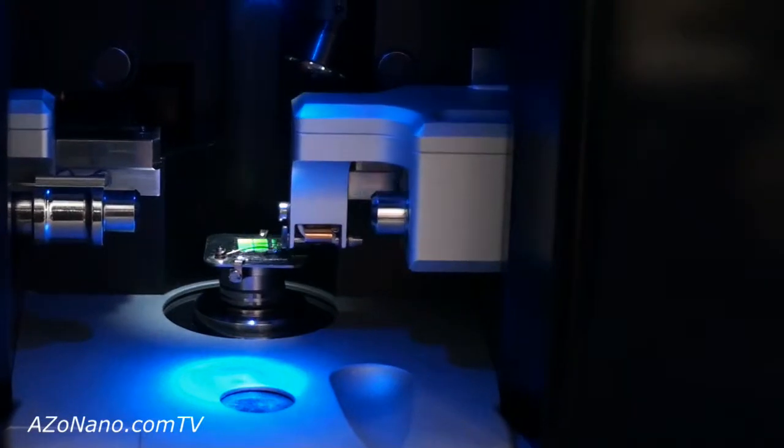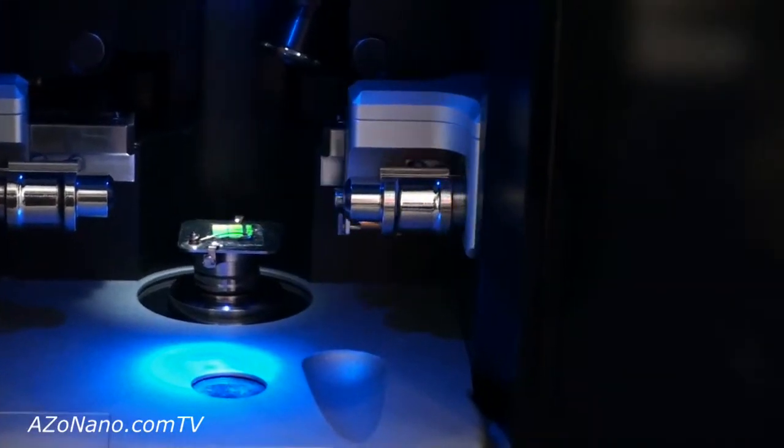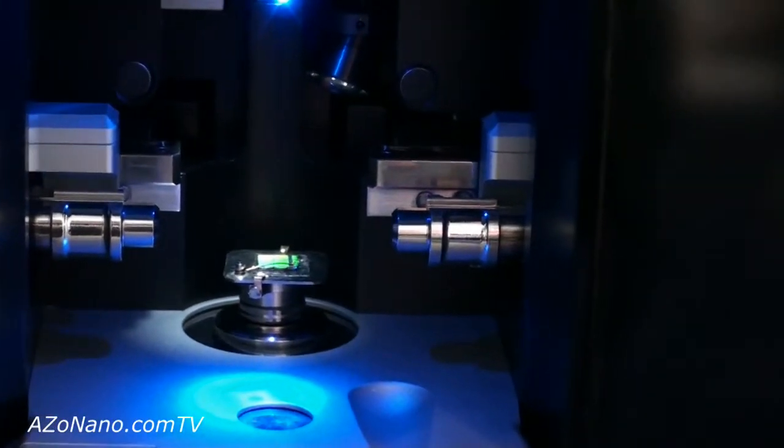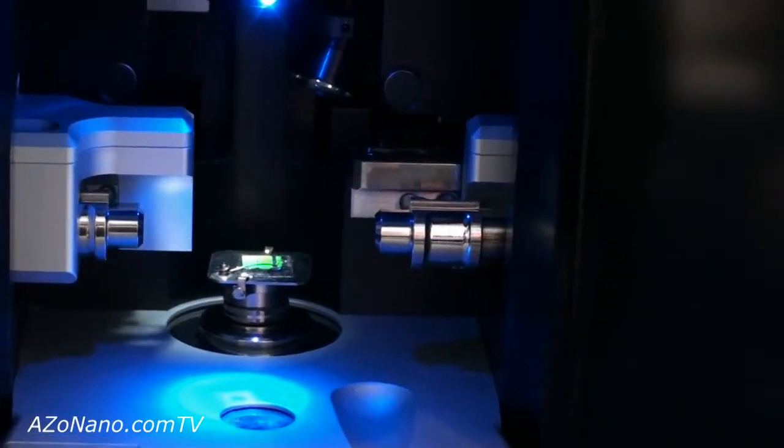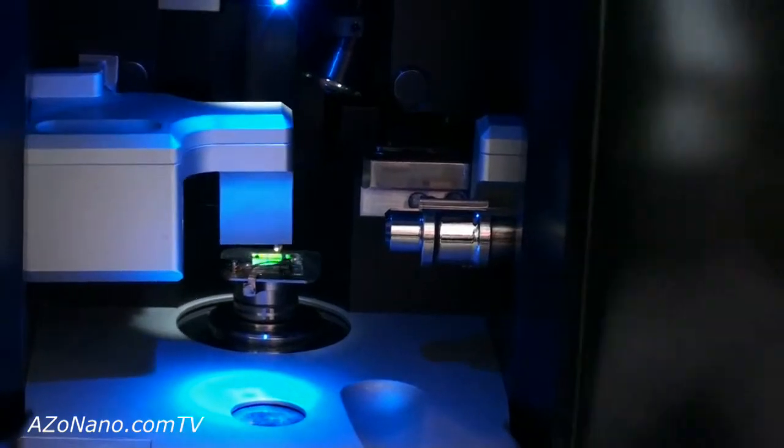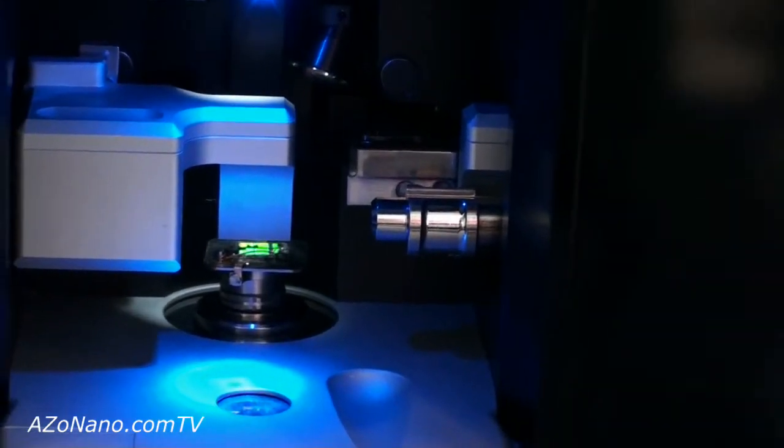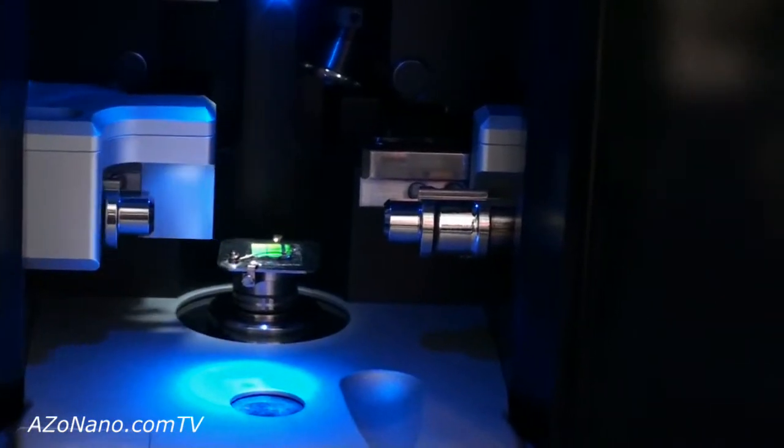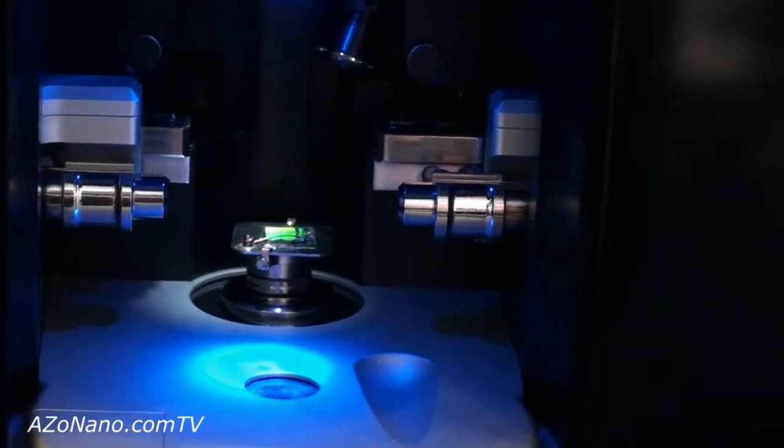So we now move off the AFM head and bring the STM head in place, just easy like this. I'll bring the AFM head back and show other features.